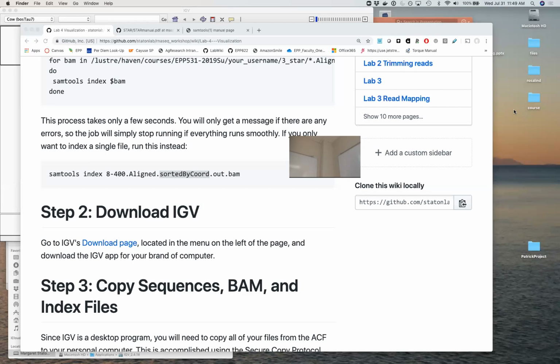I was checking my email, it was a big email. So I sat down and there are three SCPs that you have to run, copying the FASTA file, the TFF file, and the BAM file. He can probably help you more, pointing you to where those are. I think they're in the lab. They are, they're in the genome folder. Now, you can run. It says data move for one because that's the first data move. So you've got to use that. Lab implementation.